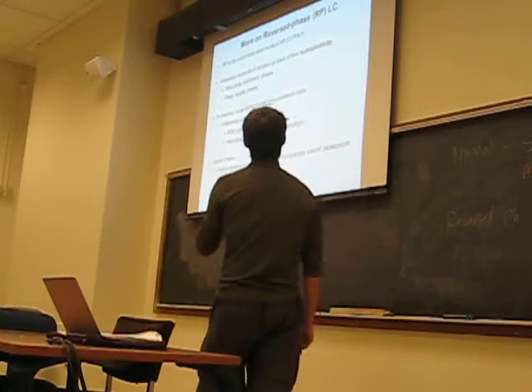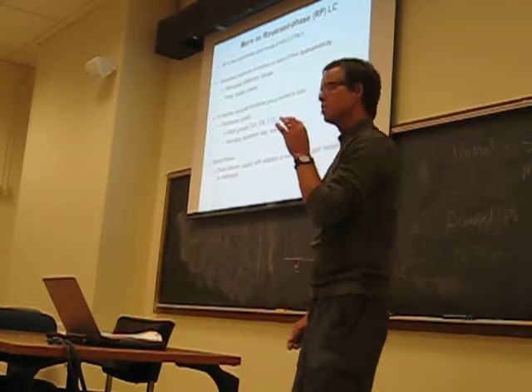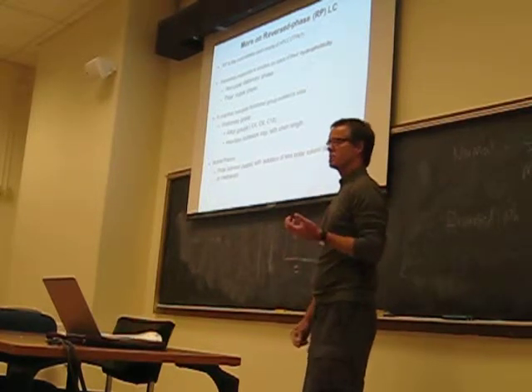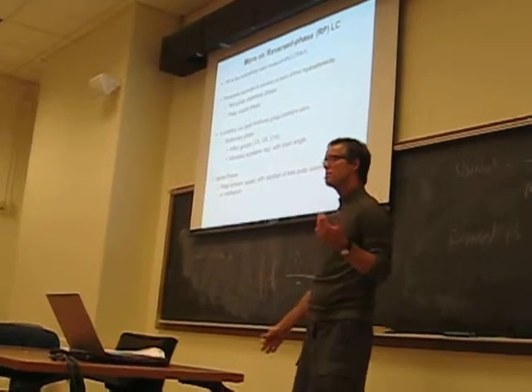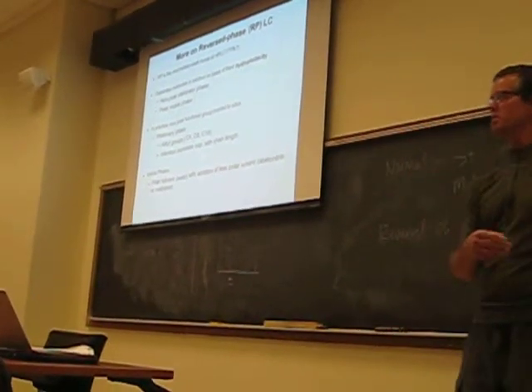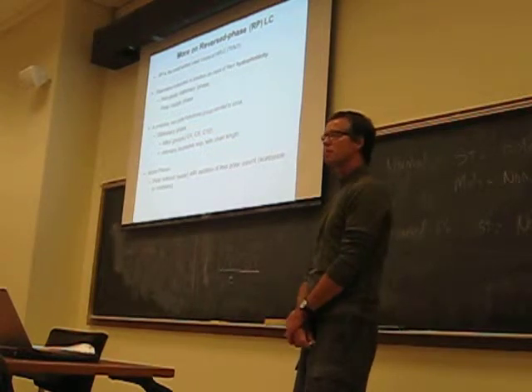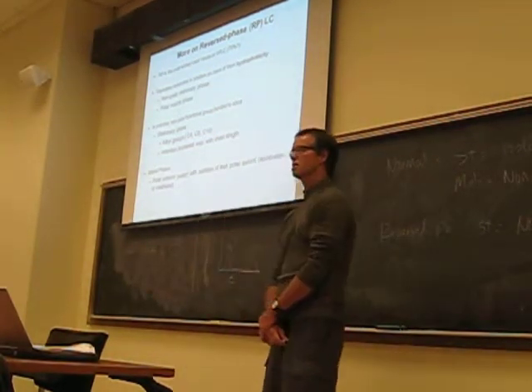Quickly, stationary phase deserves, reverse phase deserves a little bit more of a mention because it's probably the most commonly used chromatographic separation scheme in chromatography. And I'd say there are probably about 75%, and that's maybe an understatement. If you look at HPLC separation methodologies that are published in the literature for different kinds of experiments, I bet you at least 3/4 or more, maybe 80% of them, are reporting experiments utilizing reverse phase chromatography.